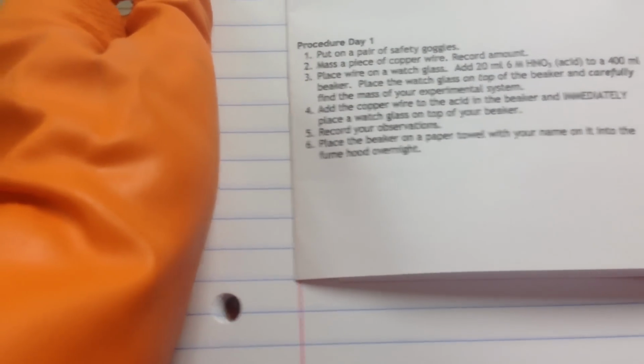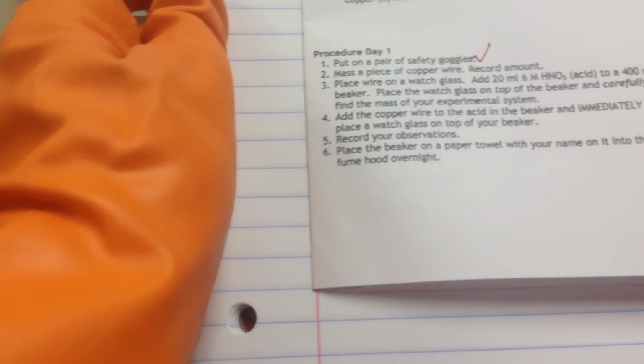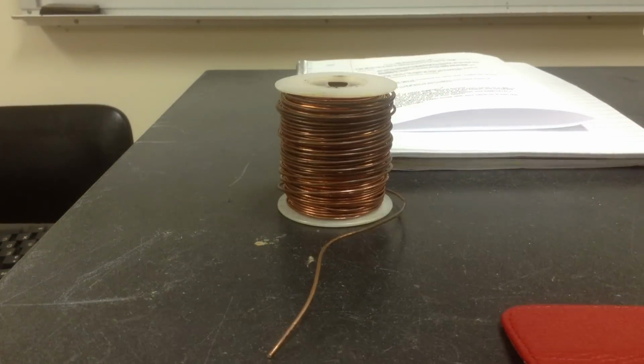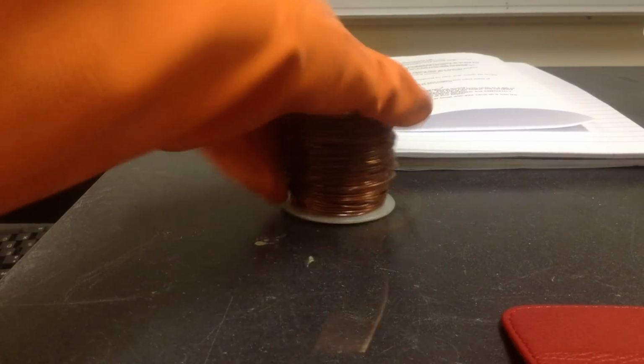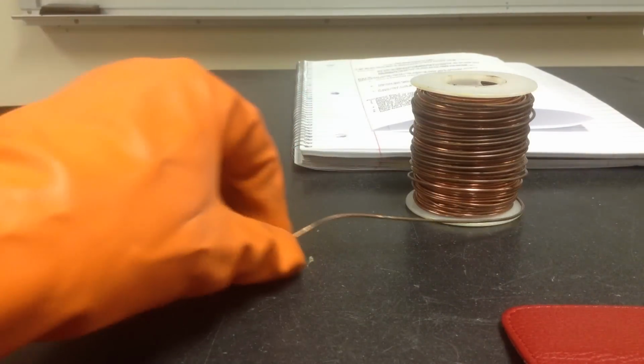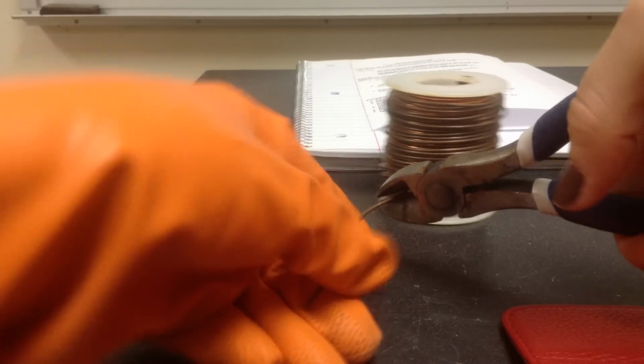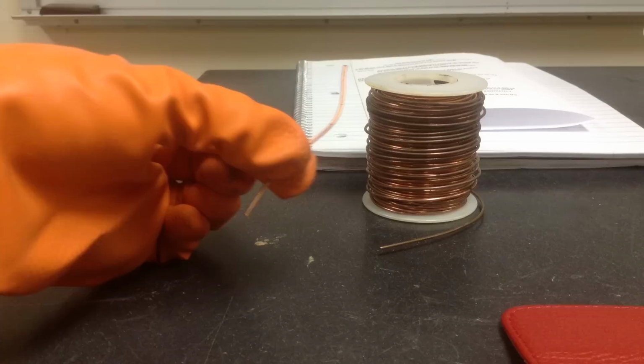The next thing we need to do is mass a piece of copper wire and record the amount. Right, so here's the copper wire we're going to be using. We don't need all of it. We're just going to be needing a snip. It's about that much.